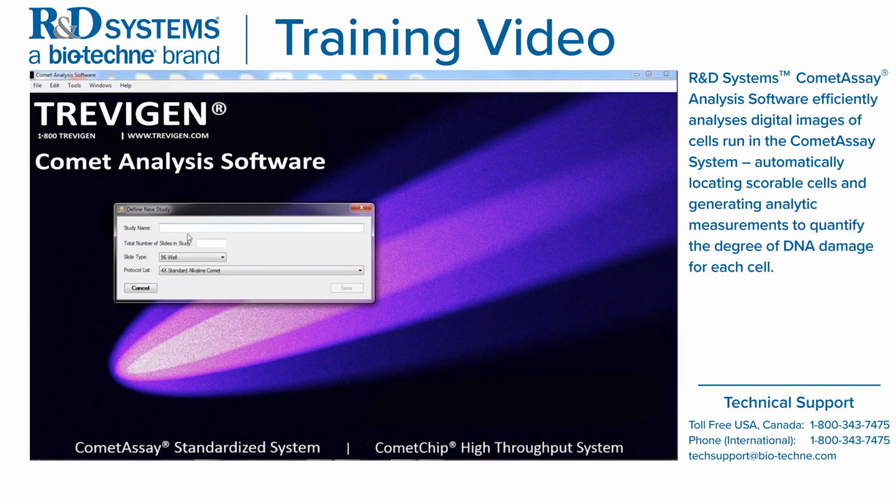So we're going to give a study name. For this study, we're going to call it 4X CometChip Test Images. And my study used 3 slides. And for my slide type, they were 2 well. And to begin with, let's use a default protocol called 4X CometChip alkaline comet. And then we're going to hit Save.